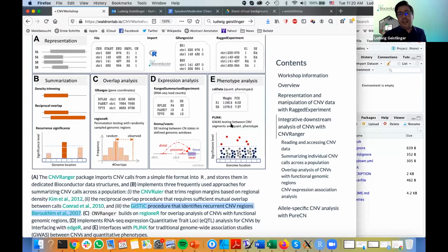And then I, of course, want to do association tests, right? On the one hand, I want to associate copy number variation with gene expression, to see whether there are genomic structural changes, copy number changes, that are indeed detectable on the expression level. Thus, a copy number variation change induces an expression change. And for that, I would maybe also have read counts from an RNA-seq assay for these genes. Here I have, for these 3 genes and these 2 samples, read counts mapped to them.